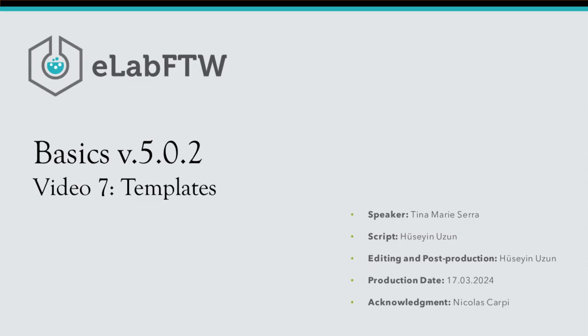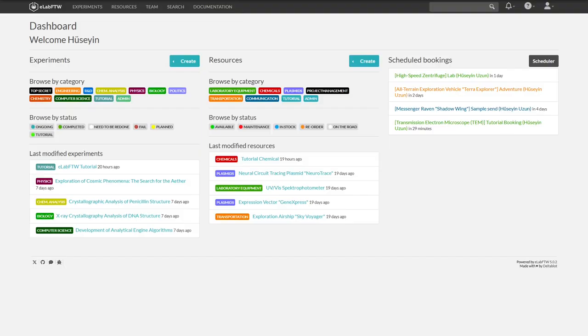Welcome everyone. In this video we will explore templates in eLab FTW. There are several ways to access the management of templates.